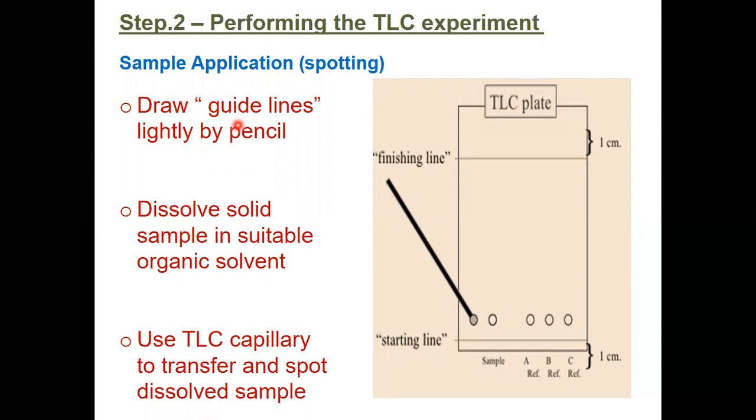Dissolve the solid substance or mixture which is going to be separated. Dissolve solid sample in a suitable solvent, and with the help of the TLC capillary tube, transfer or spot the dissolved sample on the guideline.